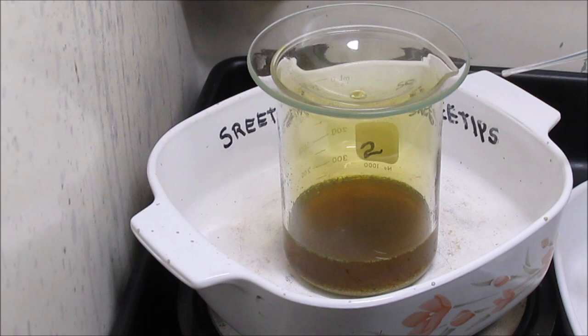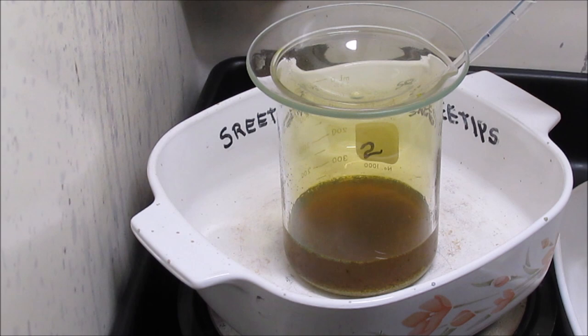Beaker's been on here now for about 30 minutes. I've got 2 mL of nitric acid in there with it so far. I've got another 1.5 in this pipette. We'll go ahead and start adding it slowly, see if we can get the rest of this stuff to go into solution.